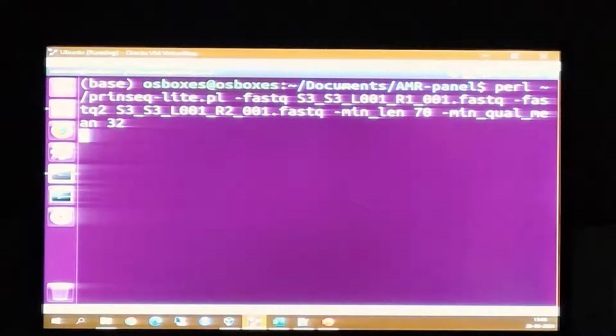So if you have multiple samples like here, S3 and S7, how to separate all of them? If you put all samples at a time, you cannot process it. Only one command per sample. We cannot do it like mapping files. We cannot put the output separately either. At the end we have to rename them.